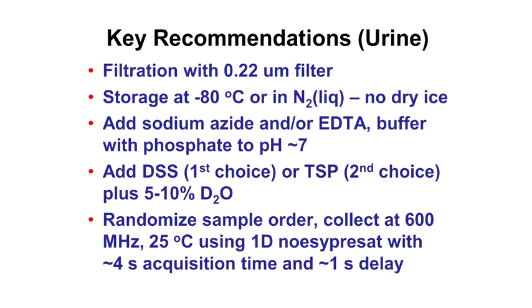So in terms of modern NMR-based metabolomics, the practice by most NMR labs doing this, there are these two different approaches. The one largely pioneered by Jeremy Nicholson's group, which is to use statistics and chemometrics to identify, in this case, the red peaks as being the most significantly altered and the blue peaks as being the least significantly altered. So this was done in the days when we really didn't know what was in biological samples, when we didn't know what was in urine, we didn't know what was in blood, and we didn't know what was in cell extracts or saliva.